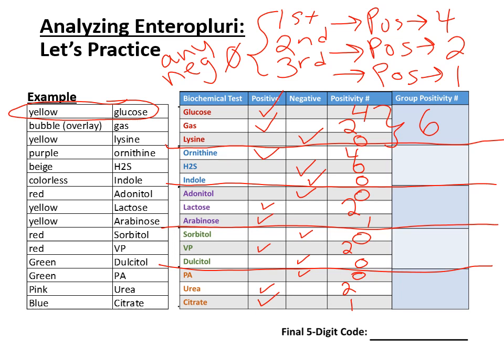Okay, 4 plus 0 plus 0 would be 4. 0 plus 2 plus 1, that would be a 3. 0 plus 2 plus 0, that would be a 2. Sorry, I should have kept showing you the brackets. And 0 plus 2 plus 1 would be a 3.